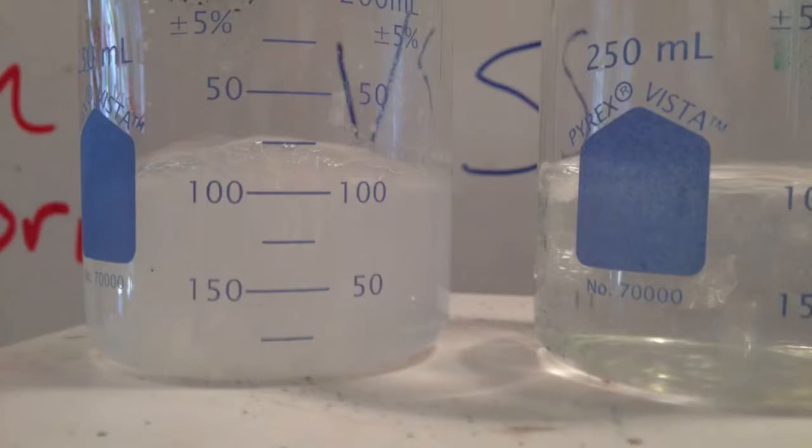This is an example of the different solutions. The one on the left is sodium chloride. The one on the right is the magnesium sulfate. And you can see different things are happening in each one. Make sure you're recording your observations. What color changes happen, how much salt you're adding to each of the solutions, how long it takes for things to dissolve. Every detail is extremely important for understanding what's happening in these solutions.